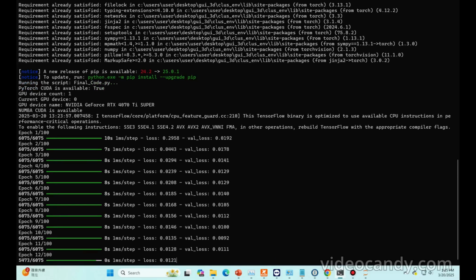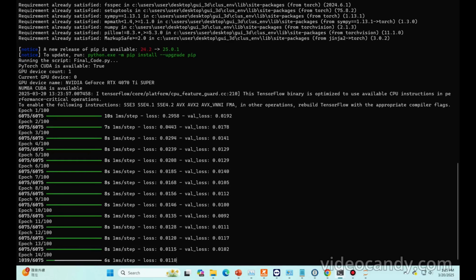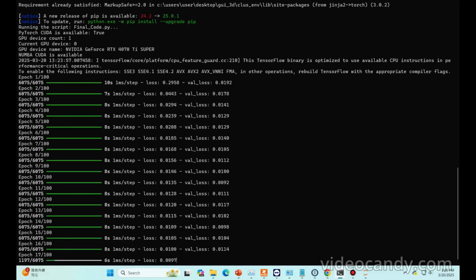And other is like you can see how it's going to analyze fish behavior in different tanks. So this will be really helpful for future studies. This is a concrete data set that mostly we use to analyze, and we check according to different systems.